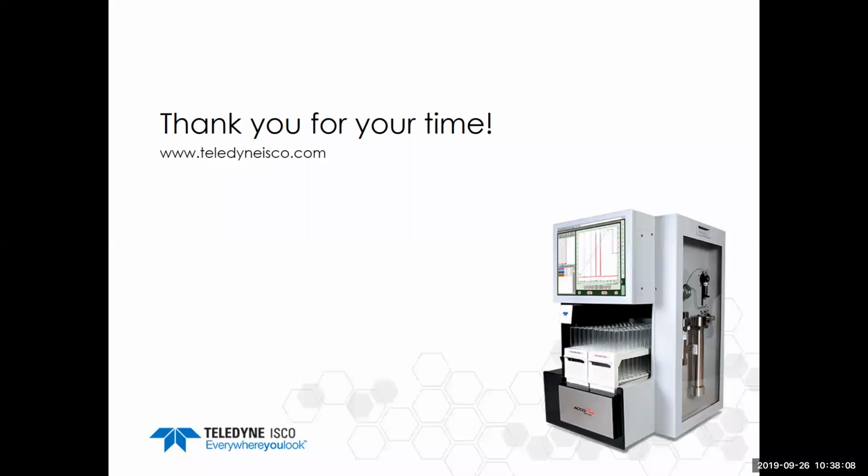Is this only applicable for reverse phase is the next question. For the flash systems, unfortunately, yes. There's some reasons for that with respect to the way the silica runs between normal phase and reverse phase. However, on the Prep LC system, on the AccuPrep, we have run it with normal phase with silica gel, and it works surprisingly well with the same calibration that we use for reverse phase.